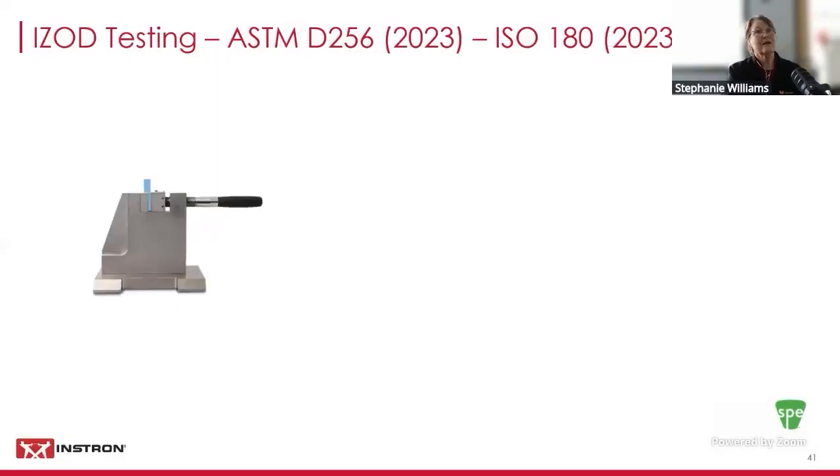So now let's look at Izod. Izod is actually the most commonly run pendulum test in the US. ASTM and ISO both each have a version of it, D256 for ASTM, ISO 180. Both standards were revised in 2023.